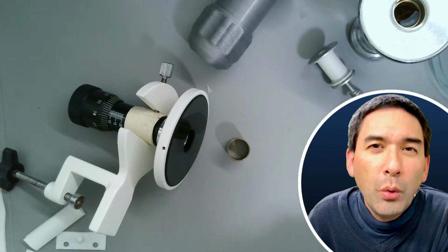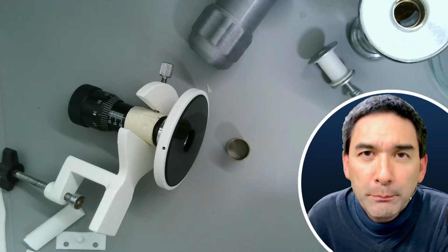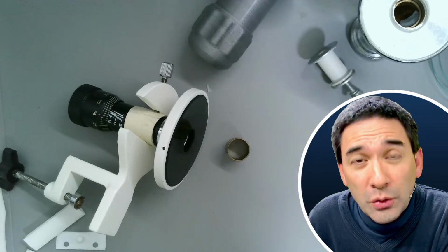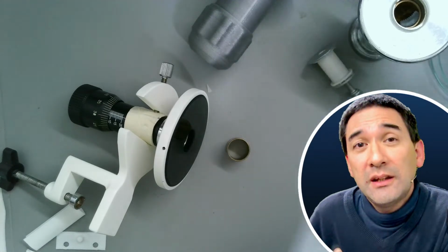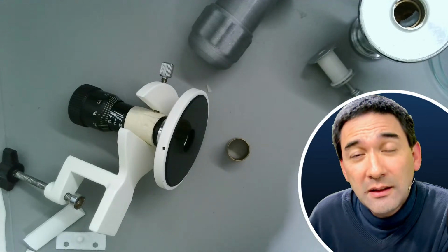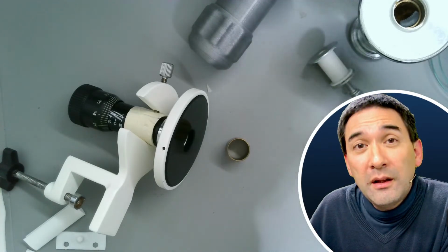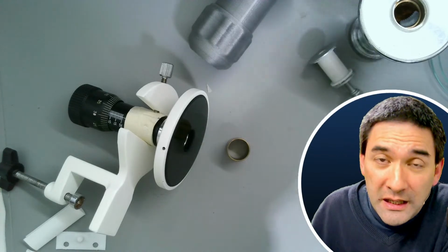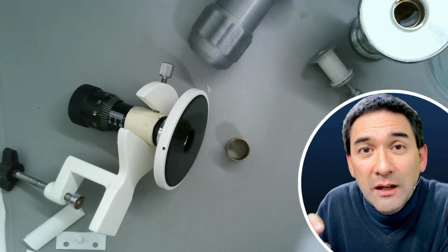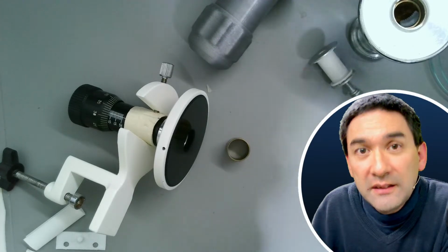Try to avoid, especially in the tropics, large temperature changes. Sometimes there is air conditioning, and air conditioning does have the advantage that it removes the moisture from the air, so that's good. But it also means that the optics and the microscope and everything cools down. And then when the air conditioning is off and warm, humid air starts to come into the room again, the humidity will condense on the colder surfaces. And then you have water there, right?